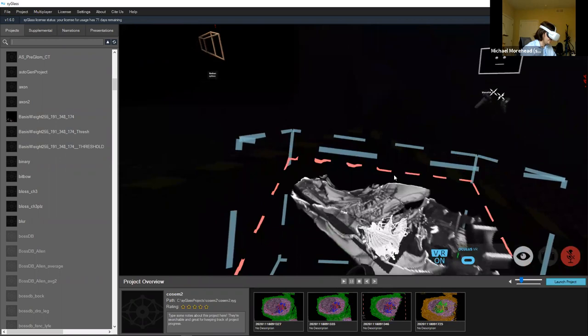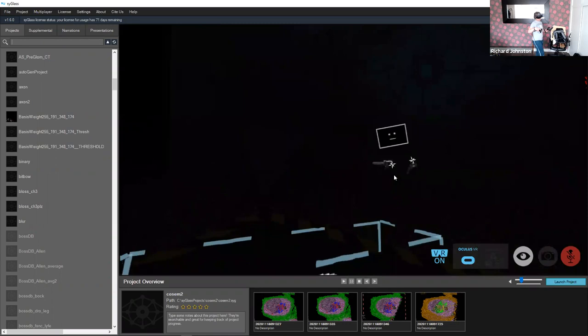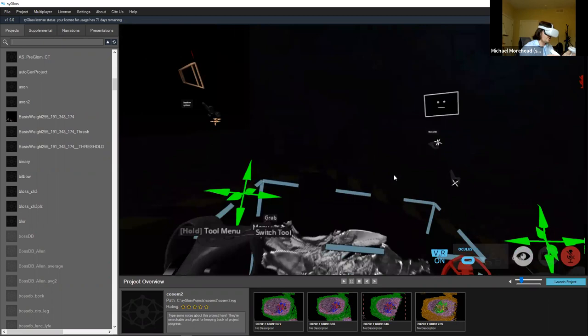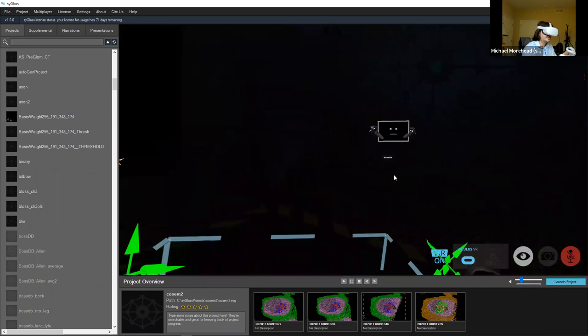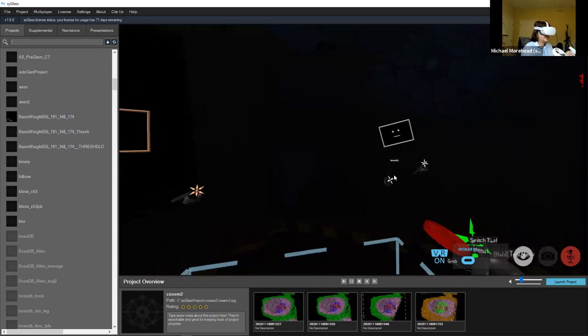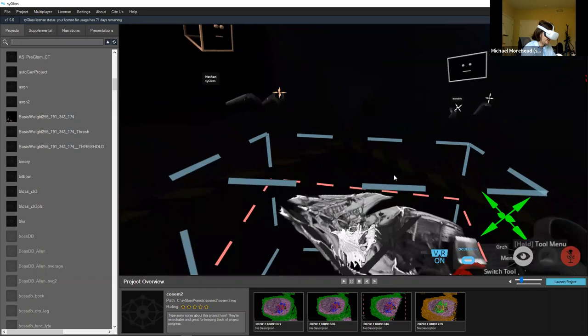If you're using a paid account and others are on the free version in multiplayer, they can join, watch, move the data, and slice, but they can't paint, segment, measure, or use the counting tool. You could show those features to them — but if they want to interact, we can provide temporary licenses.